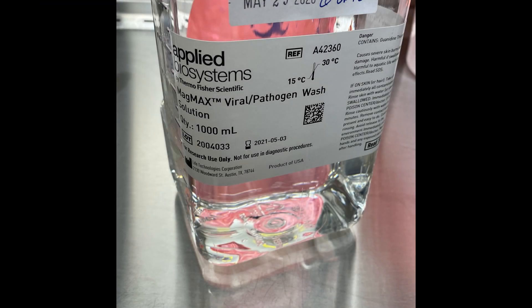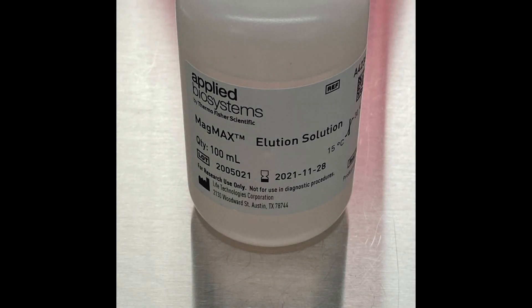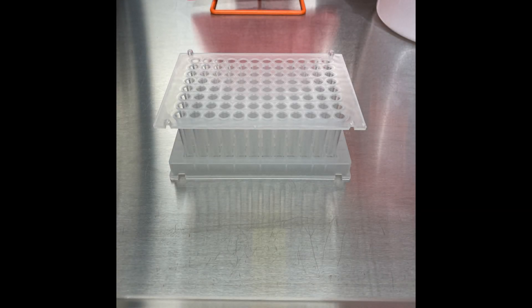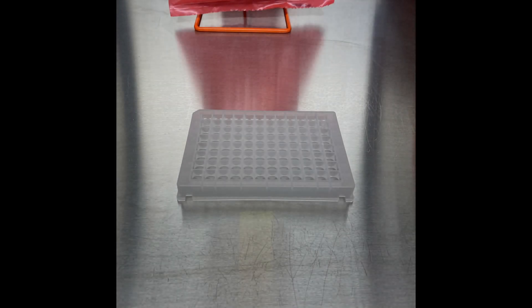The first reagent is 500 microliters of MagMax viral pathogen wash. Next is 1,000 microliters of 80% ethanol. Last is 50 microliters of MagMax elution solution. The final piece needed to complete the KingFisher Flex setup is the tip comb plate, which is the combination of a KingFisher tip comb and a 200 microliter 96 well reaction plate.